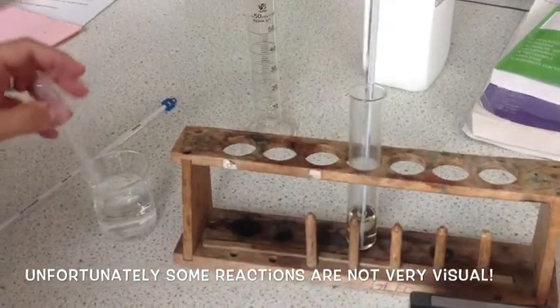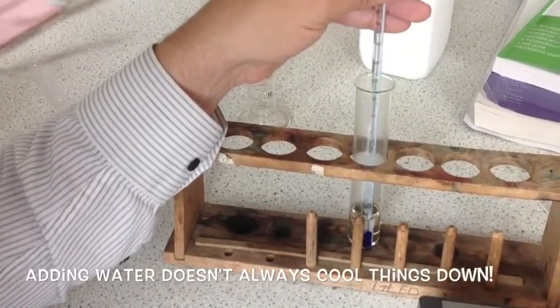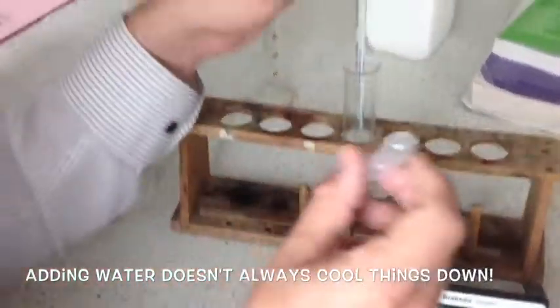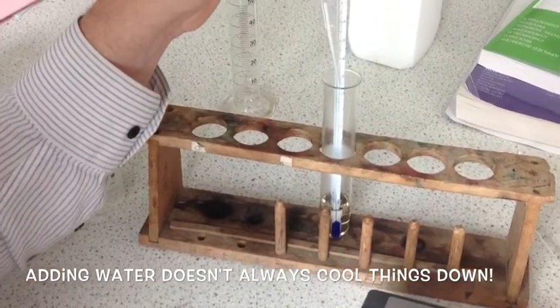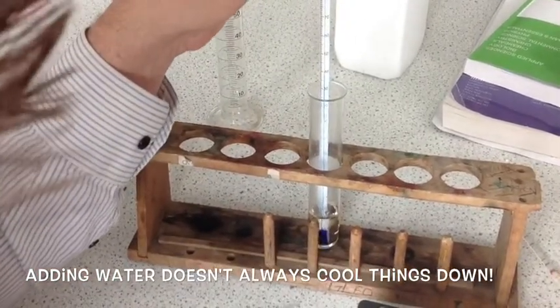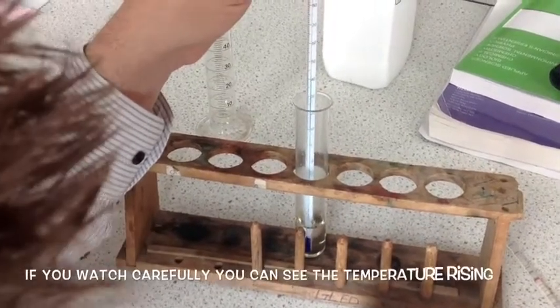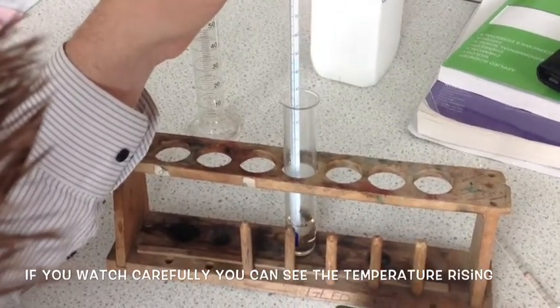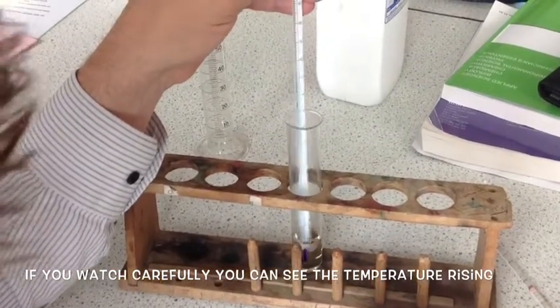Now the reaction, when I add 1 drop, has gone up by 2 degrees, which you might not think is a very significant amount, but it has raised quite significantly. Now what I'm going to add here is just about 1 ml of water and record the time taken for the temperature to rise, and hopefully I should be able to show that I would be able to measure a decent temperature rise. If I start at the same time and record the temperature every 5 seconds, then the temperature's gone up by 1 degree in the first 5 seconds. In the second 5 it's gone up by 3. It's now at 48 degrees, and the temperature continues to rise up to 53.